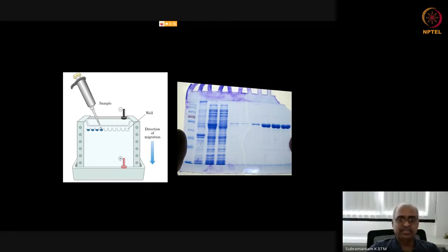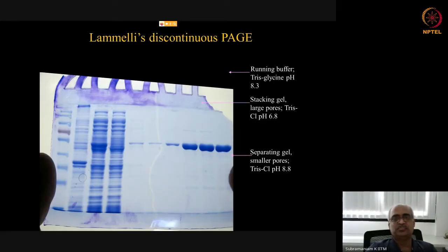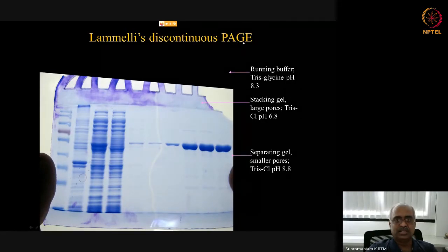So we do a certain modification to this basic simple gel such that these two are no longer an issue. The shape is made uniform for all proteins, and similarly charge is also made uniform for all proteins, and that modified version is called SDS-PAGE. Here I'm going to explain that in detail, and before I go into SDS, I want to explain one more detail about this basic polyacrylamide gel. So PAGE stands for polyacrylamide gel electrophoresis. In the most common method that we do, the separation is purely based on charge by mass ratio, and when charge is constant, therefore it is only the mass that matters.